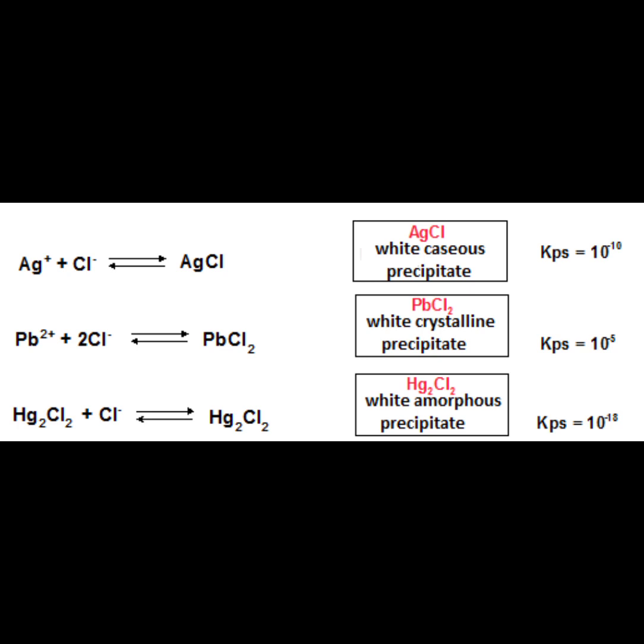Then we cool the test tube under a jet of cold water, rubbing the inner walls with the rod. This last step is necessary to precipitate lead chloride, which is not that insoluble. Lead chloride is a crystalline salt whose formation is encouraged by microscopic scratches in the wall, a larger surface. Once obtained, the white precipitate of chlorides, the solution is centrifuged and decanted.